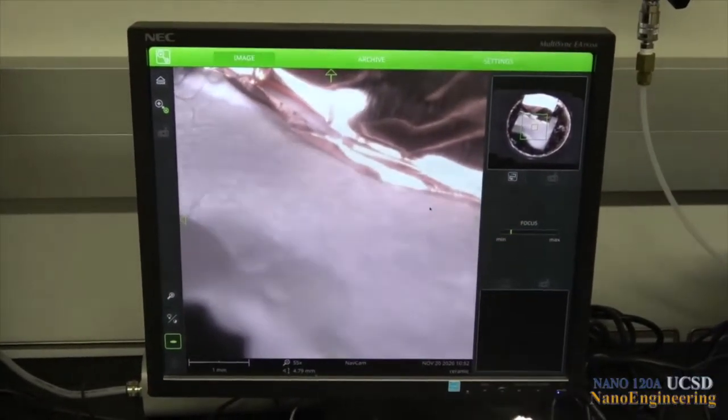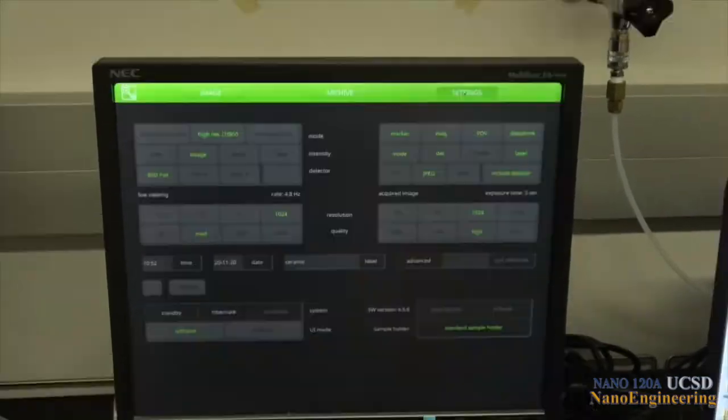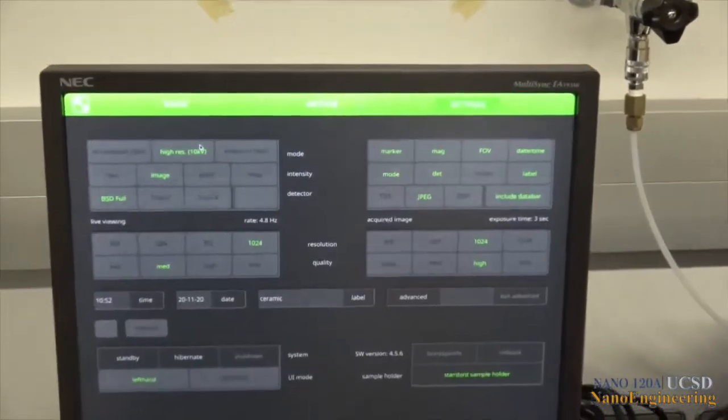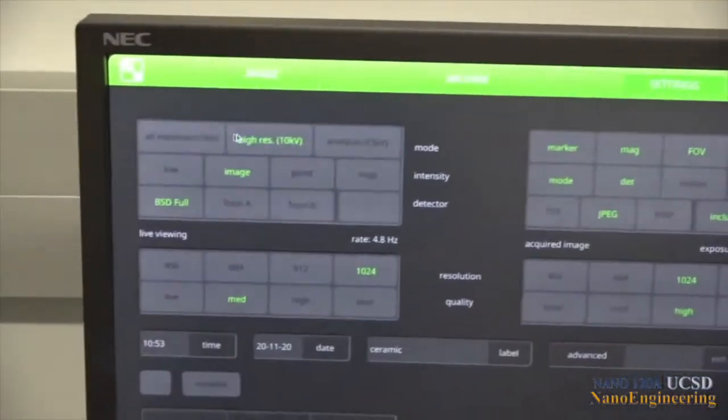At this point, the sample is still not in the scanning electron microscope portion of the chamber. But we can set the conditions for imaging our sample in the SEM by clicking on the settings icon.